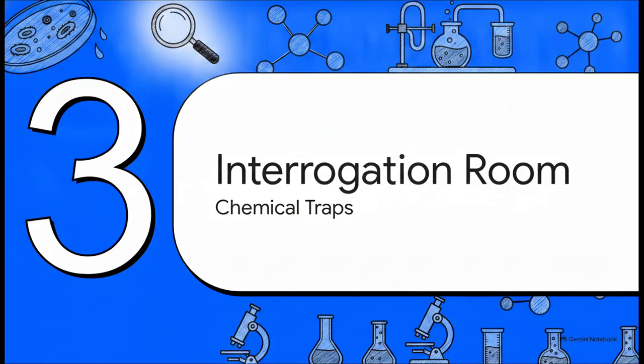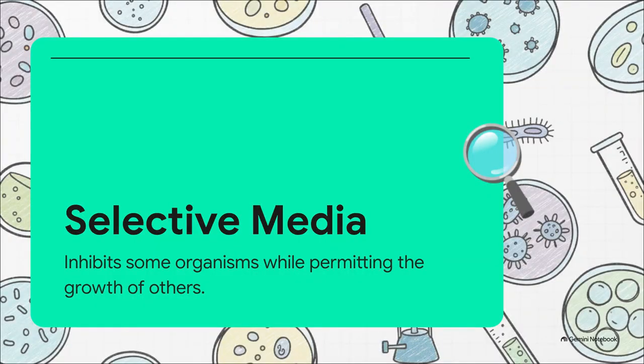Section 3. The interrogation room. Welcome to the interrogation room. This is where we use brilliant chemical traps. First, we have selective media. These act like a highly strict VIP bouncer. They contain specific substances that actively inhibit certain organisms while permitting the exact ones we want to see to grow. Then we have differential media. These act more like a chemical lie detector.